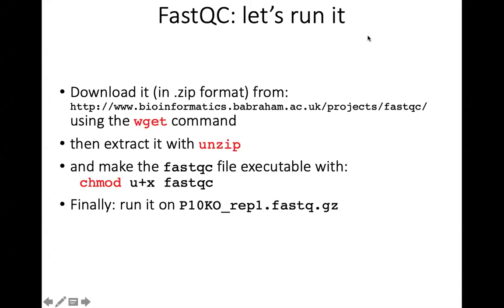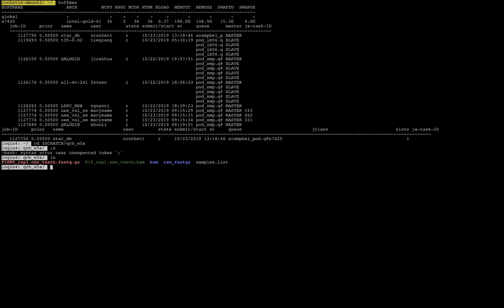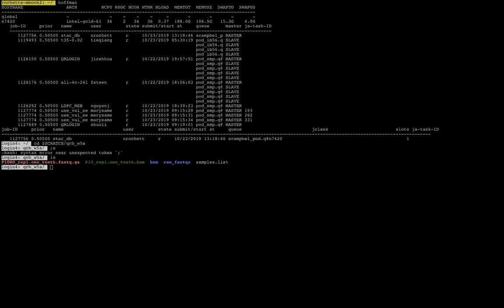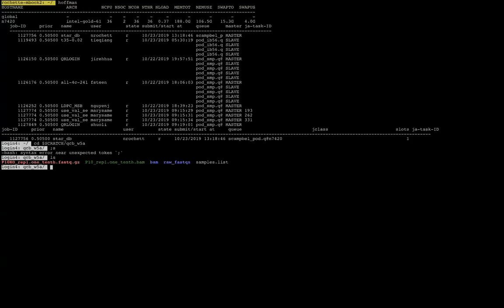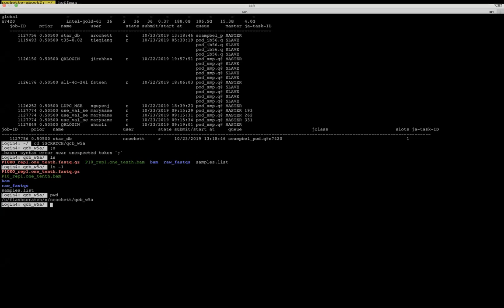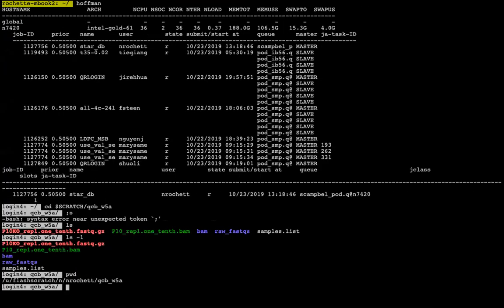One thing I wanted to mention is that for convenience, we're going to start running things so that they take a little bit less time, and I should share the different screen. This is the workshop directory, the workshop folder on the cluster, the main one, which you don't see for some reason. Oh, I need to do that. Training post. Resume share. Okay. So you couldn't see it.